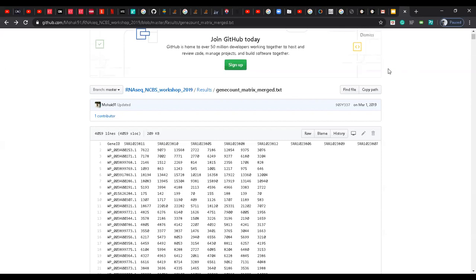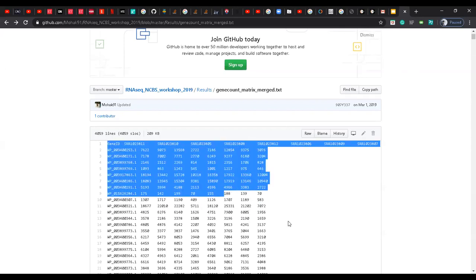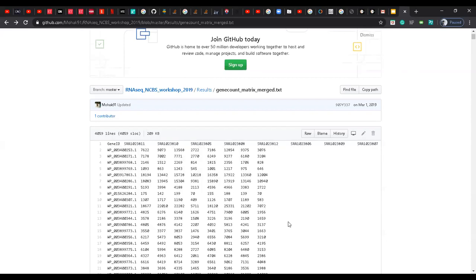Hello, can you repeat the last part? So what I'm saying is that we are now generating this matrix. In the last class, we had done these BAM conversions, right? We had generated the SAM file. We had then converted it into the BAM file, which is just the binary version, nothing else. And then we had created these.